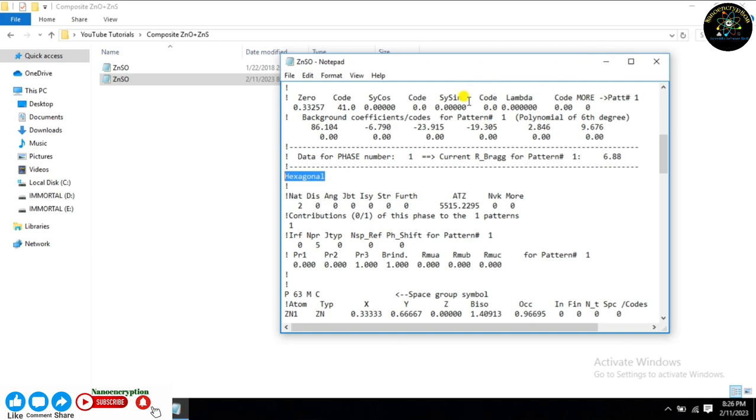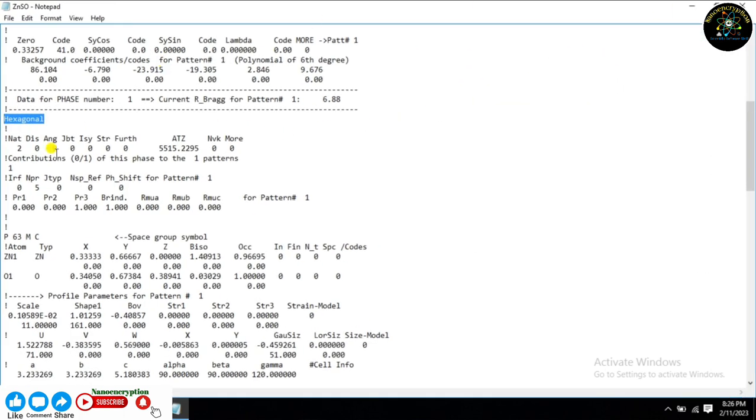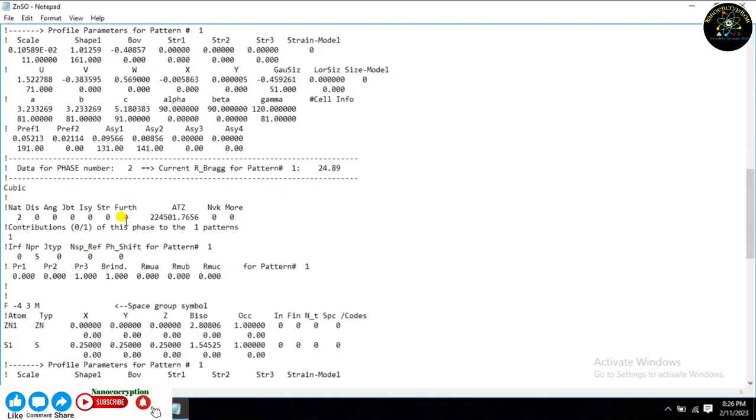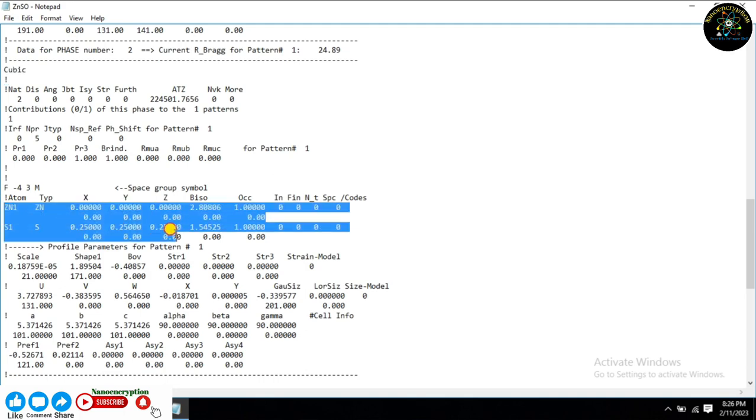Just follow every step precisely and carefully, as mentioned in the PCR file.